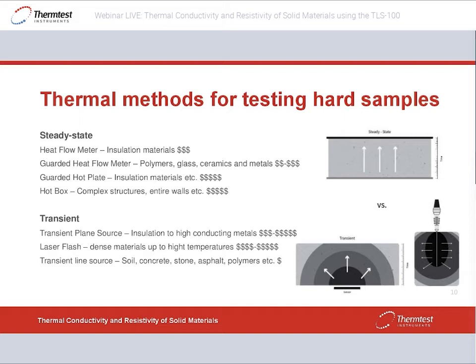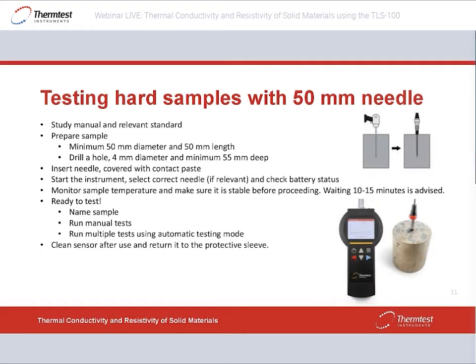So that being said, let's take a look at how to use this instrument. For testing hard samples, which is the focus of today, we normally use our 50 millimeter needle. It's the shortest needle, I should say, because it also has the largest diameter of our needles. It's 4 millimeter in diameter, which will really help you during this testing of hard samples.